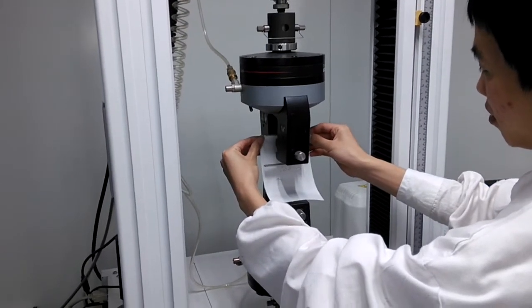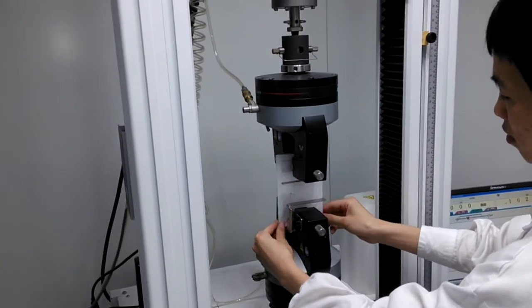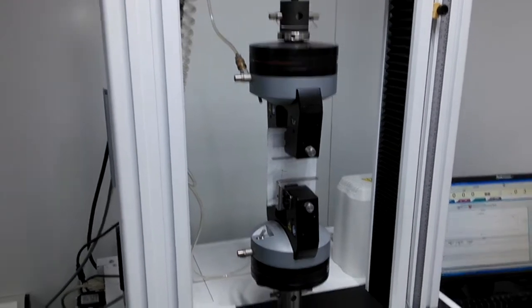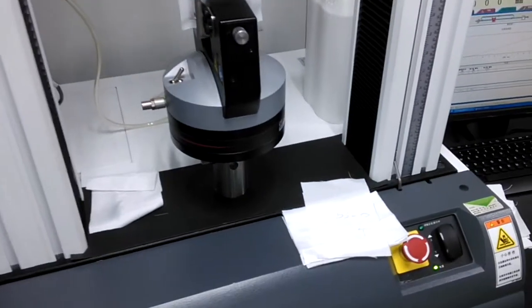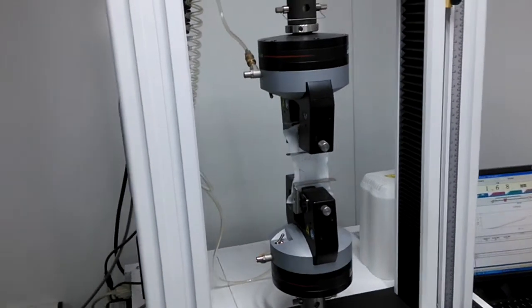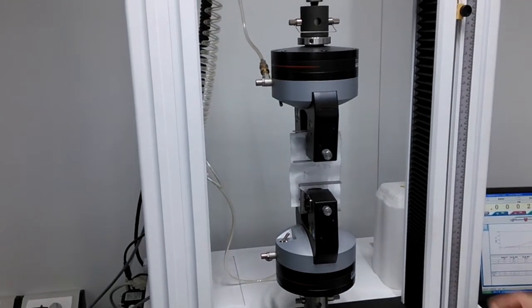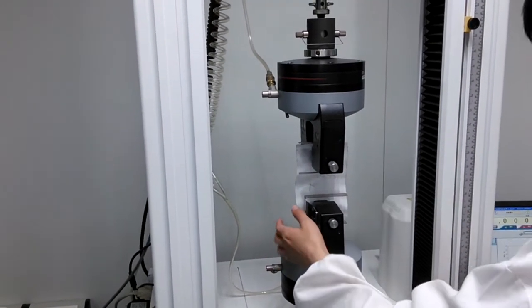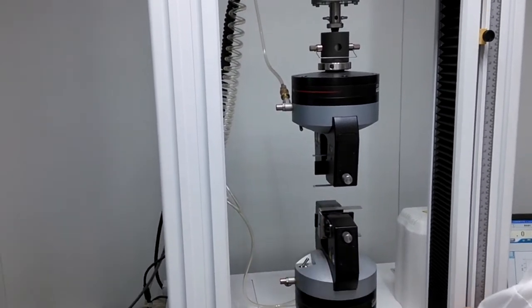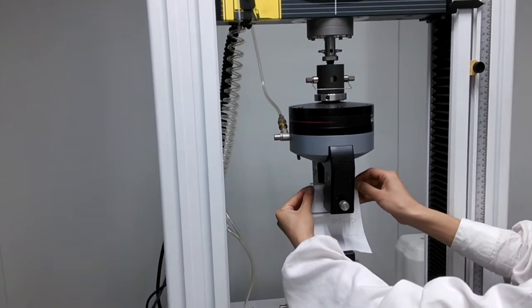This is the ASTM 5034 breaking strength test. First, we cut the sample into pieces according to the standard and place the sample into the equipment. The jaw will fasten the sample and pull it at a certain speed from two directions.